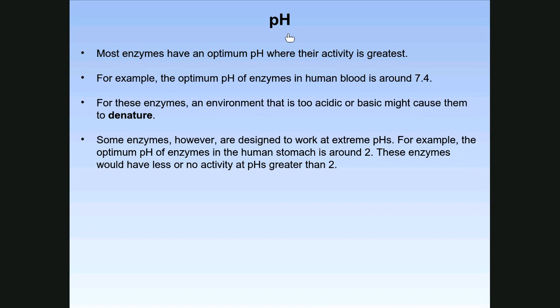So again, you first want to look at the data I gave you. I give you absorbances that are measured at 15-second intervals for a total of 120 seconds or 2 minutes. You want to look at the absorbances and see if you see an increasing amount of absorbance occurring, and then you want to compare the absorbance values from 15 seconds all the way to 120 to see if there are any differences. As I said, the greater the absorbance value, the more active the enzyme is because the more product it's producing.